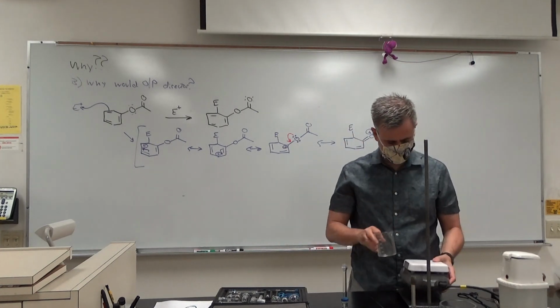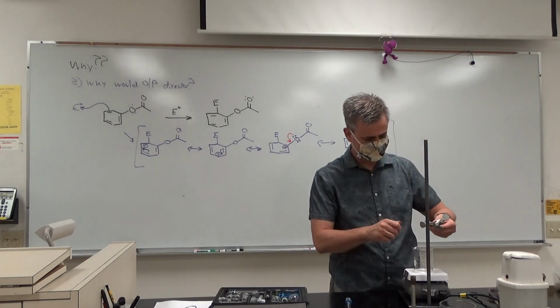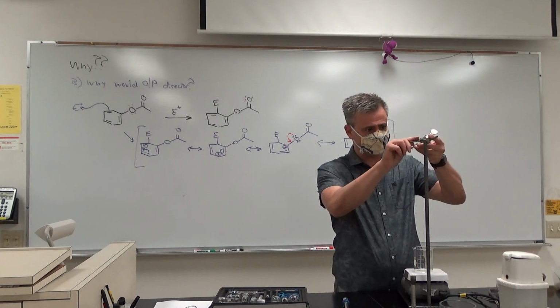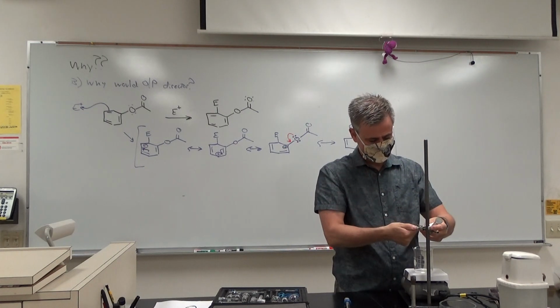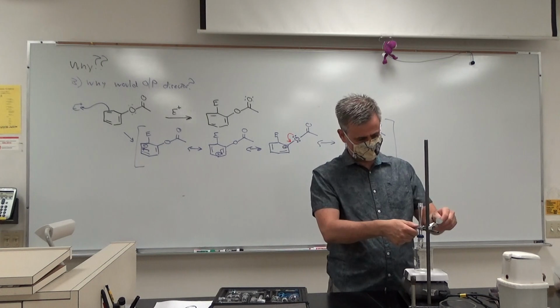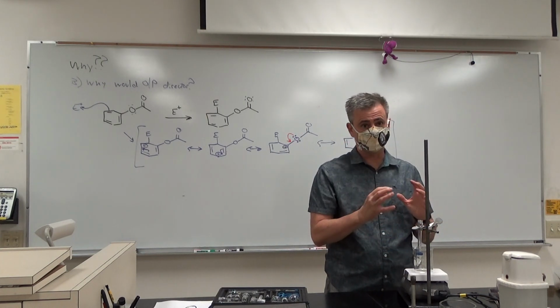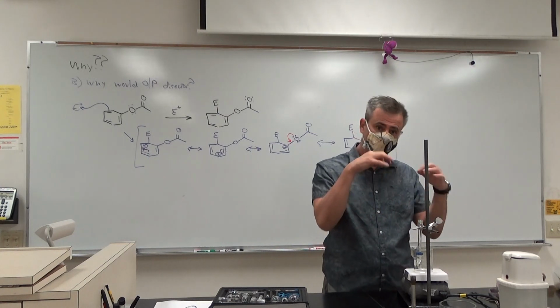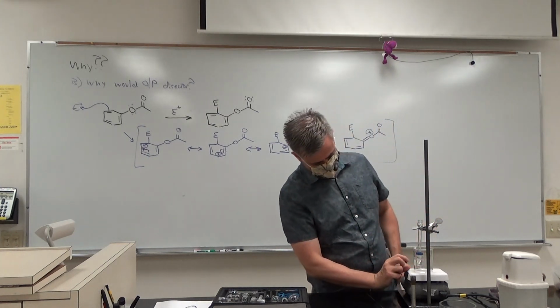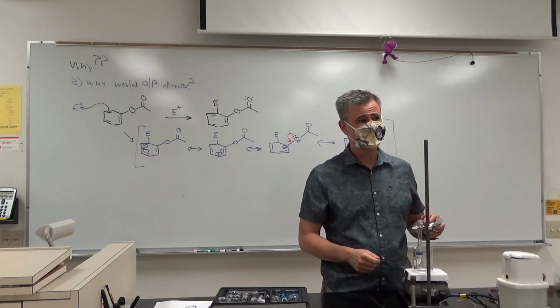Students will sometimes have the ice bath up to the very top, and then it's not stirring because it's so far away, and so they just submerge this underwater. And that blue nut and the O-ring, it's probably a good seal, but water can go in. So you just need an inch of ice bath, okay?